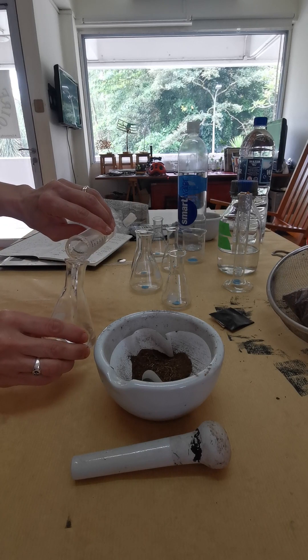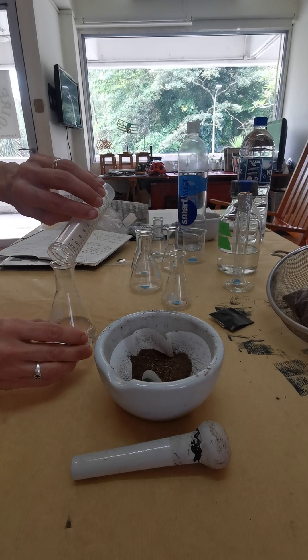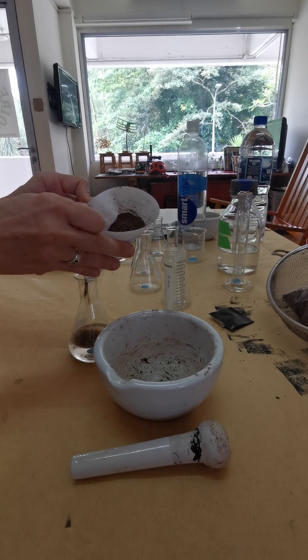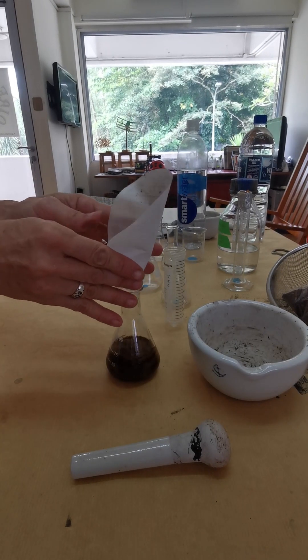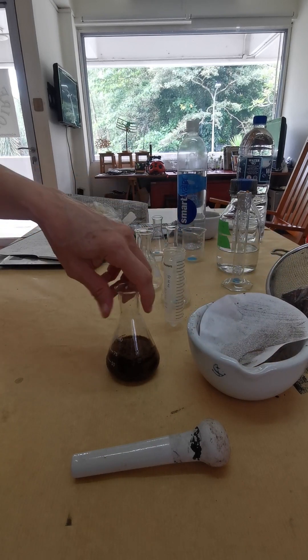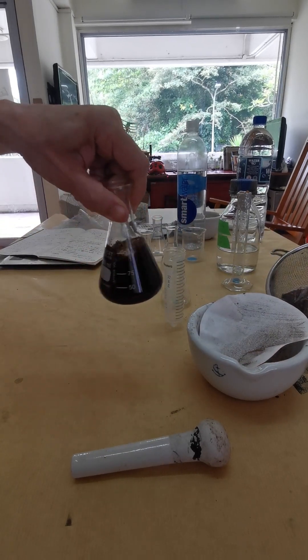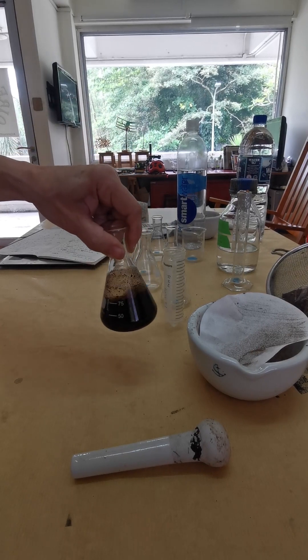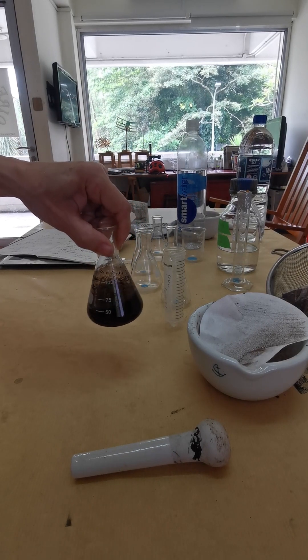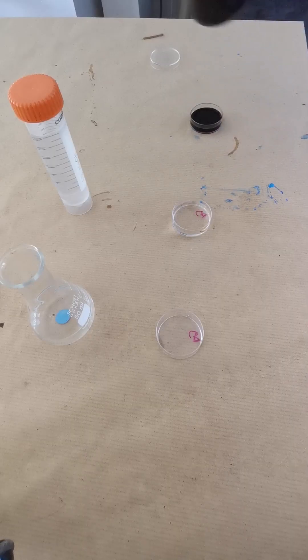Mix that with 50 ml of sodium hydroxide. You can use a funnel if it's easier. Then swirl the solution. Over the next two hours, swirl about every 15 minutes. The sodium hydroxide helps to break down the components.